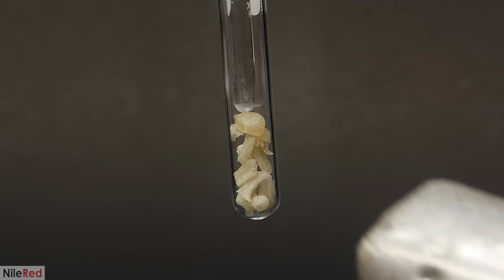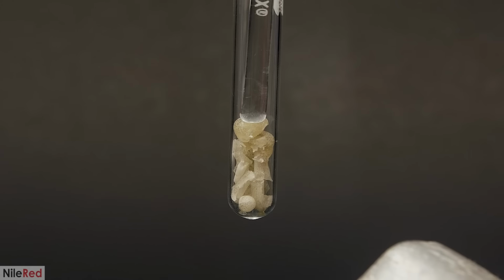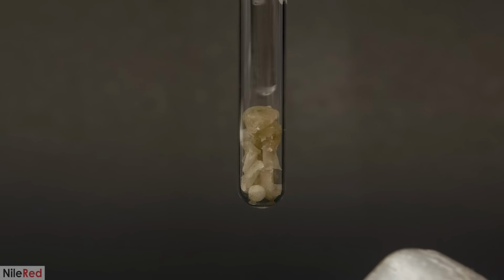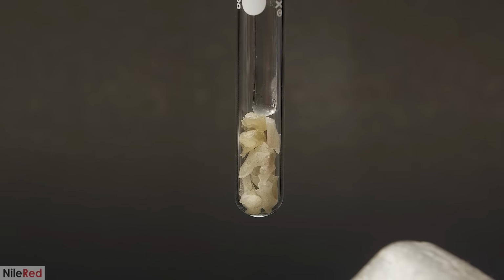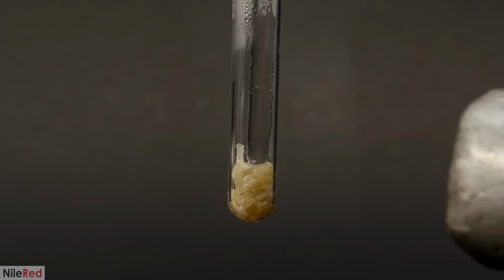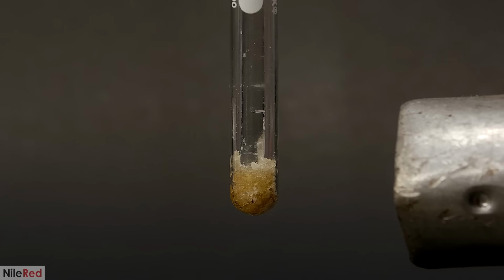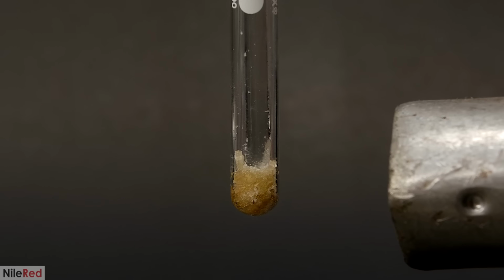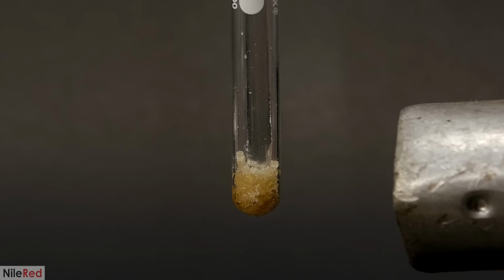I just threw all the small pieces of the butterfly into a test tube and blasted it with a heat gun. The major problem with this method is that good and constant temperature control is almost impossible. To get a good quality plastic, the temperature must be raised above the melting point, but it can't go over its decomposition point. Also, one other thing that I should mention is that cellulose acetate doesn't really melt on its own, and it needs to have a plasticizer.